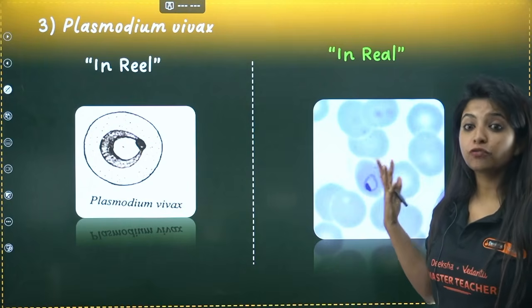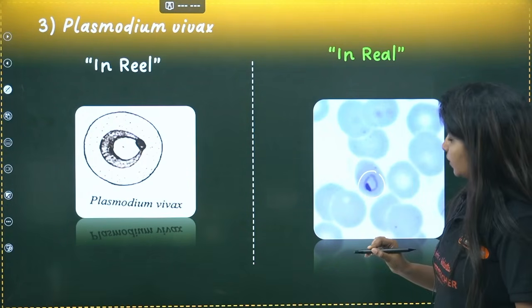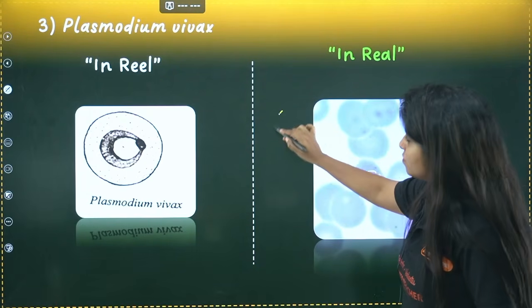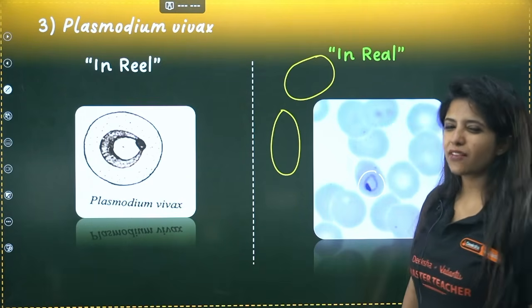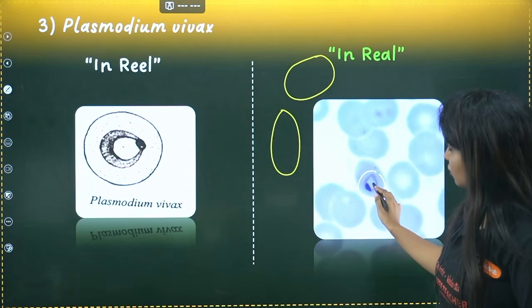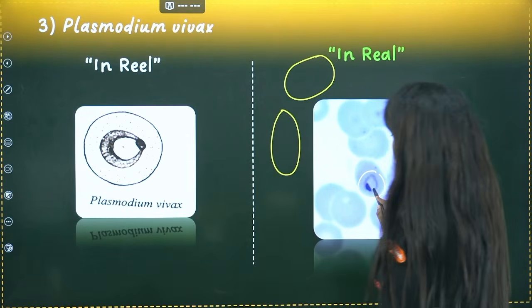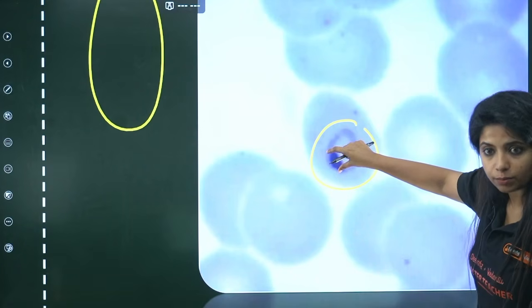Again, the distinguishing feature that you might have is this structure. If you look at the shape of the cell, it is almost like this, or it can be like this. They do not have an irregular shape. And over here, what is this structure? If I zoom in and show it to you, there is a ring-like thing out there, and then you see something like this, right?